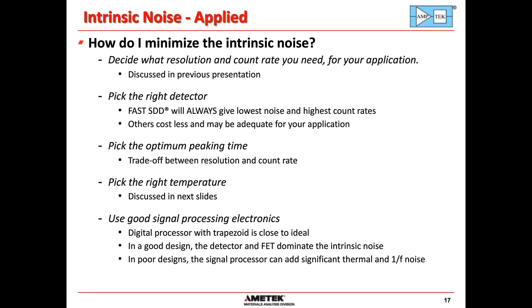Given that, you need to find, again, the optimum peaking time. Do you use the relatively long peaking time, the noise corner where resolution is best, or do you use a shorter peaking time to get the higher count rates? Using what we talked about in the last presentation and the charts in the last couple of slides, you make that decision. Then you have to pick the right temperature. I'll be discussing that in the next couple of slides.